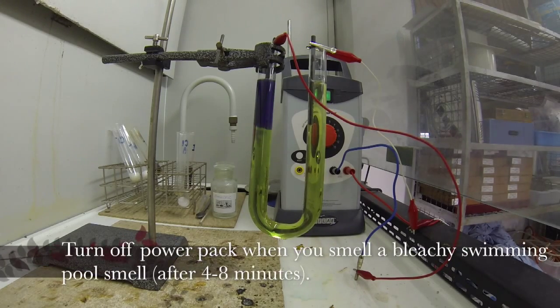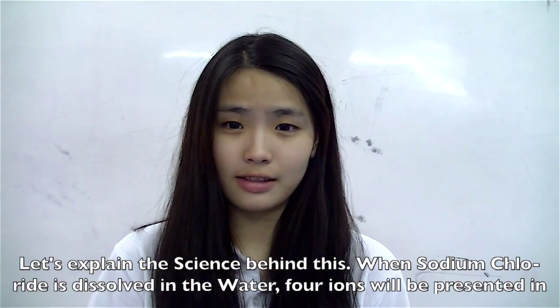Turn off the power pack when you smell a bleachy swimming pool smell. Let's explain the science behind this.